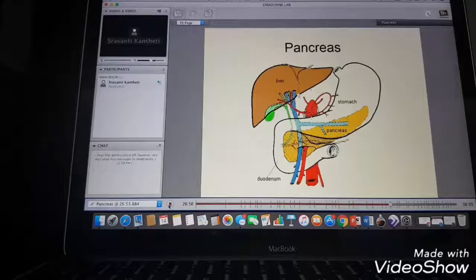That brings us to the pancreas. The pancreas is a funky-shaped organ. It looks like a shoe, doesn't it? And here's the laces. Woohoo! Now you can't stop seeing that. Let's draw a little Nike swoosh on here. There. I'm having way too much fun. Okay, so just keeping y'all awake, because I know it's hard to listen to somebody without looking at them, and at least you're getting some of my personality. So here's our shoe over here. This is the head, this is the body, and this is the tail. Okay, that's the exact terminology for the pancreas.